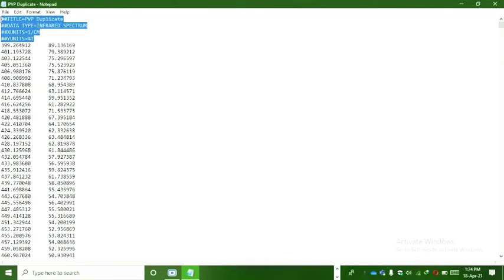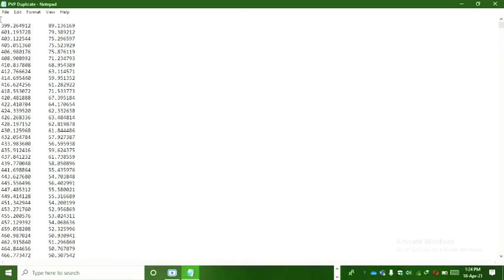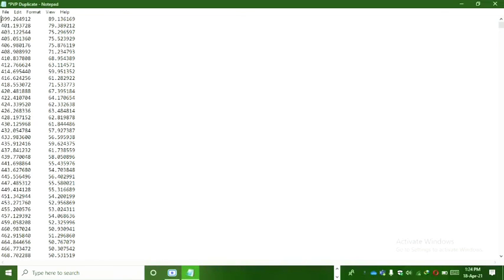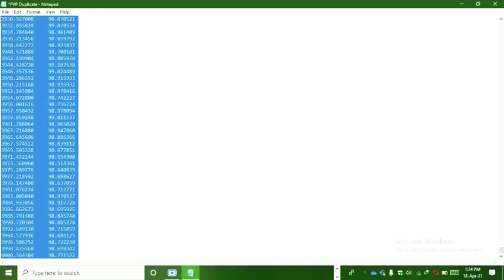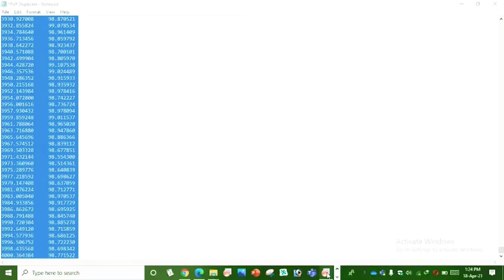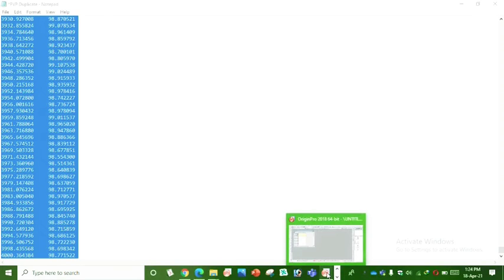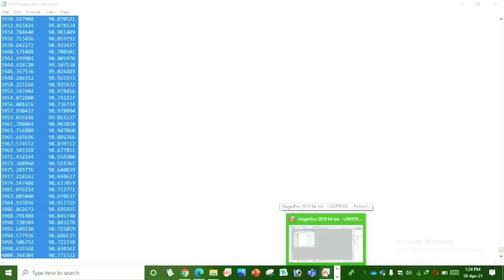We remove the comments because we need only numerical values. We copy them and I use Origin software, Origin Pro 2018 version.